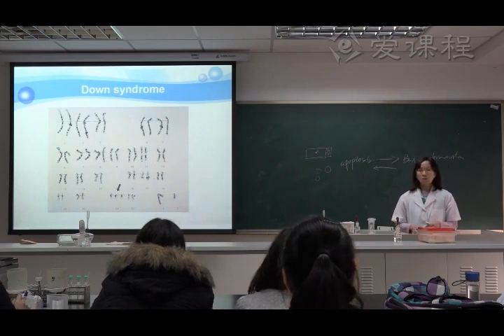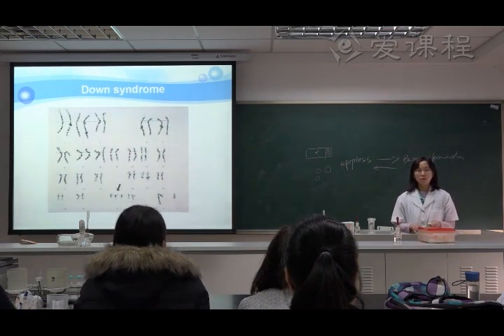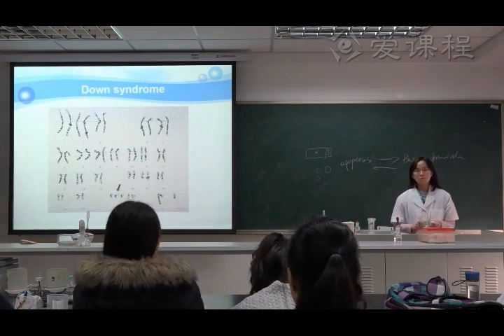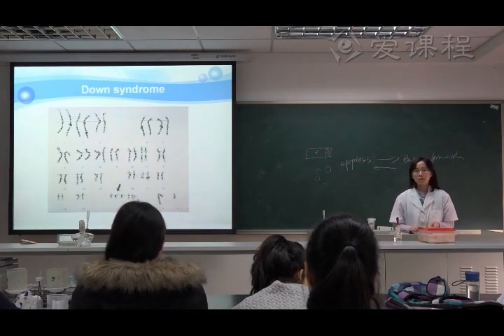Today you can number the chromosomes. You can count how many chromosomes there are in your experiment.